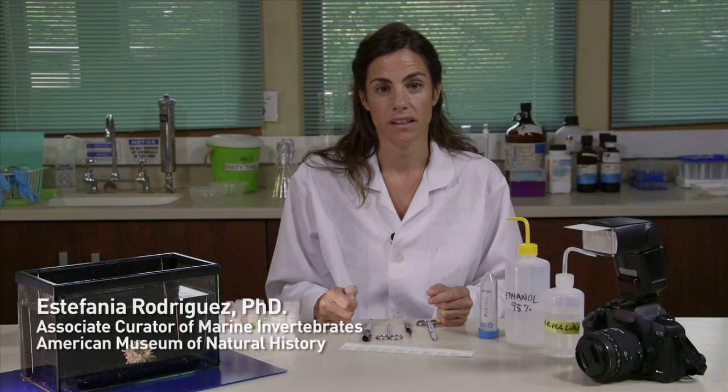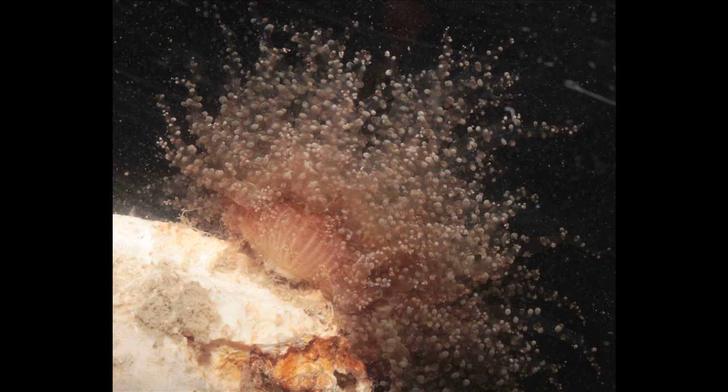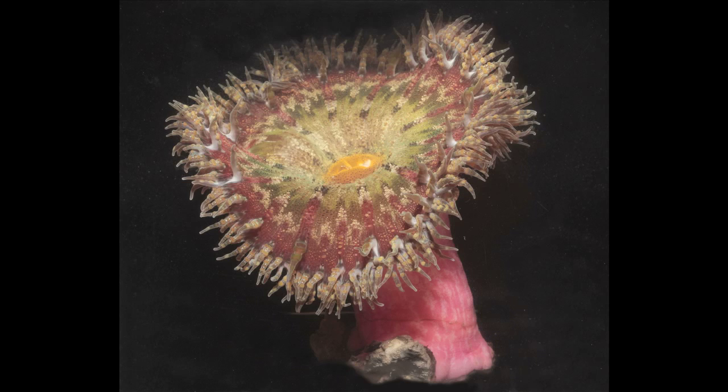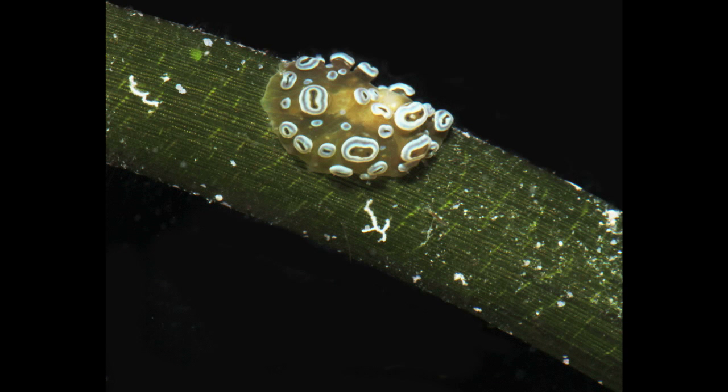With sea anemones, it's very important to record the color pattern and the different states of relaxation of the anemone. During the preservation process, colors are lost, so you need to make pictures to have these characters. You will require images from the oral disk of the sea anemone, but also others that will show the column and the structures in the column. Additional images with the anemone contracted are always useful.